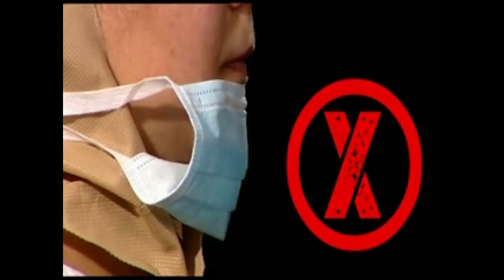The mask should never be worn around the neck at any time. If the mask gets damp, it should be immediately replaced with a fresh one. While replacing the mask, hand sanitization is a must before applying the fresh one.